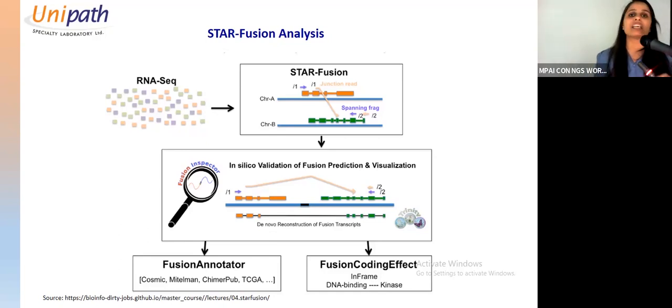And this read is mainly a split read, right? Because this read has been split. It can be in one ratio, 25% on this and 75% on this, or it can be 40% on this and 60% on this. It can be anything, but the read has split and given you an idea that something has gone wrong here, right?